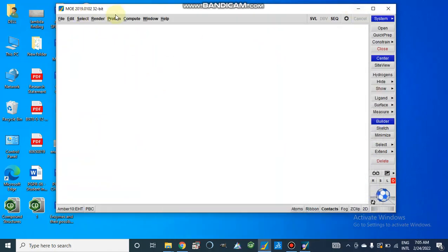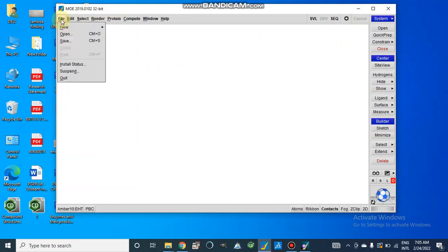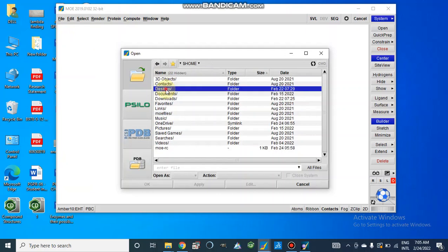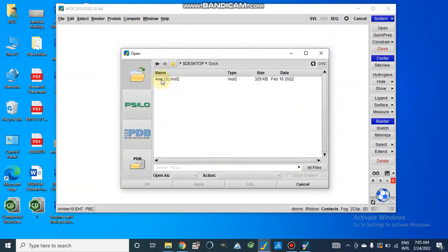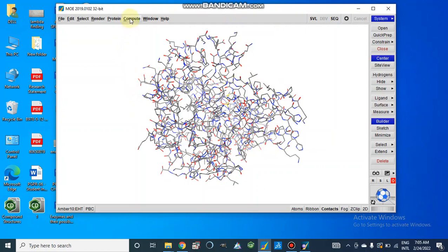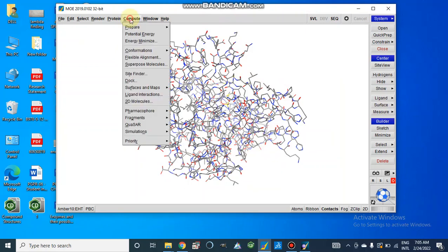For 2019 variant, we will go to file, open, and here we have already made a folder on desktop. This is doc and it contains the same enzyme in mol2 file. So here we can obtain our protein which is energy minimized in our previous video.